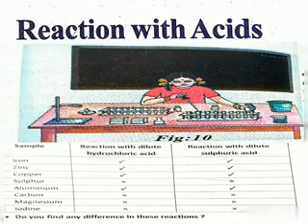In the figure, the girl is adding hydrochloric acid to a test tube with the help of a dropper and observing the reaction. If you find no reaction, heat the test tube gently. If you still see no reaction, add 5 drops of concentrated hydrochloric acid.